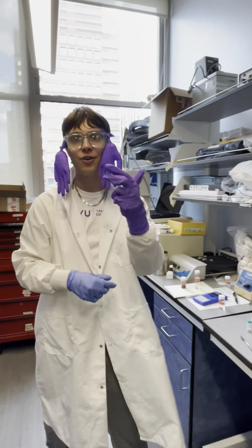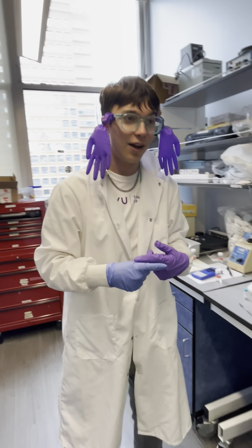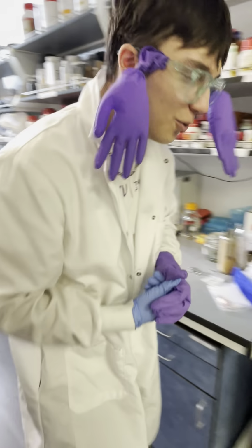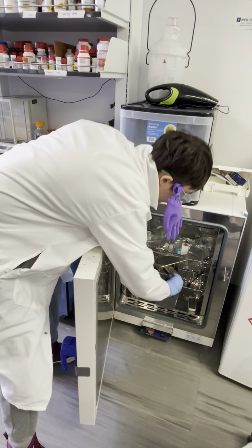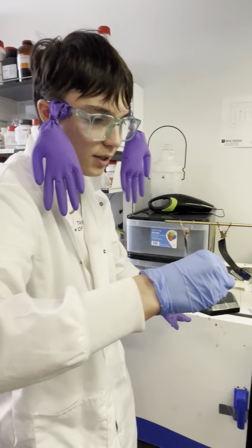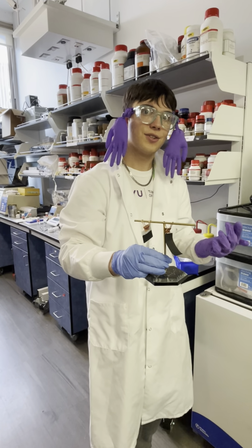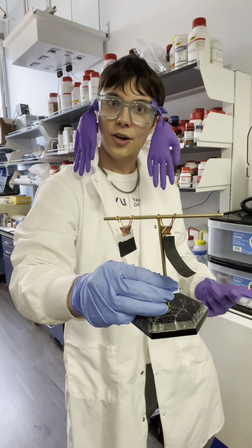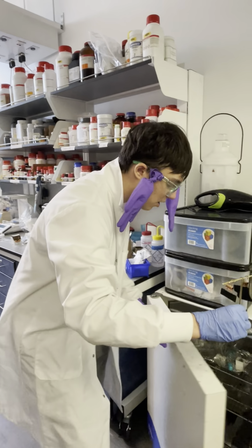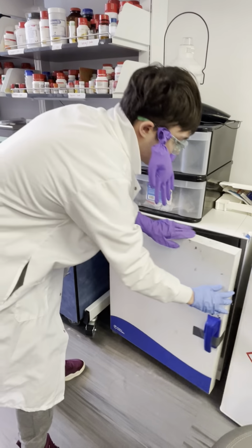So now, what do we do when we have these slurries? Well, we have either aluminum mesh, copper mesh, or aluminum foil or copper foil. Those are used as current collectors, and they collect current. So here in the dryer, after we produce the slurry, we take the mesh and we coat the slurry onto the mesh like so. And we leave it in the dryer overnight so that all the NMP solvent evaporates out. And then we just get on the mesh an electrode, literally an electrode that we can then put into a cell and actually get batteries out of it.